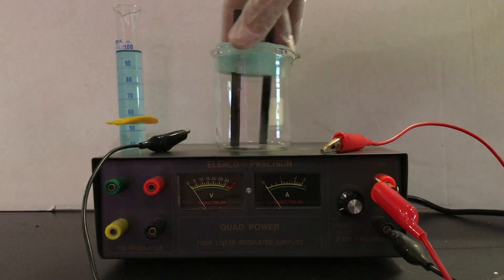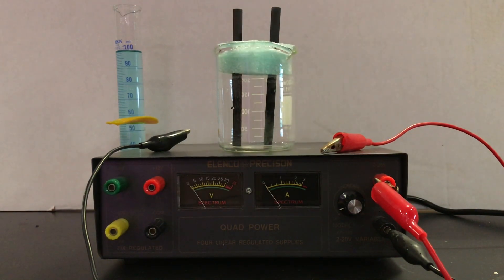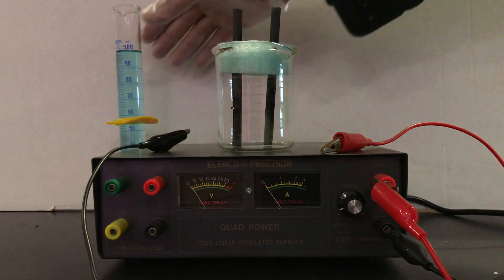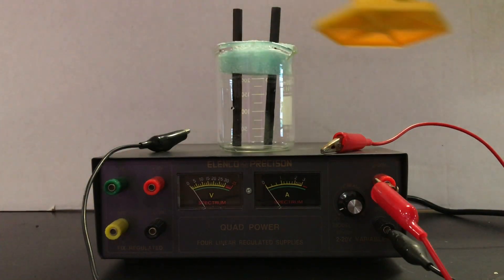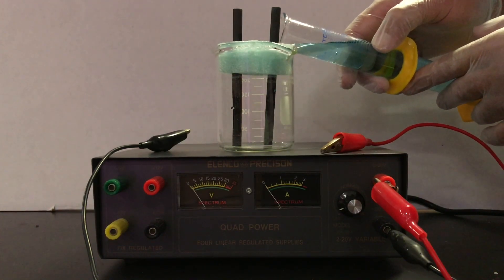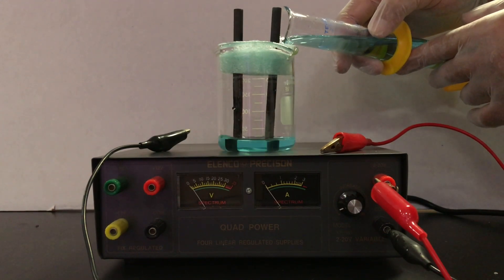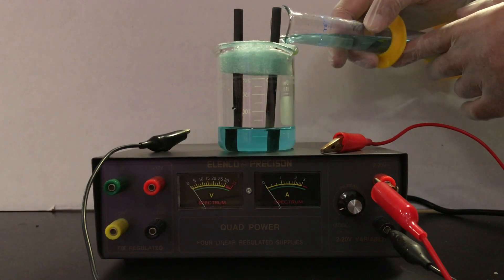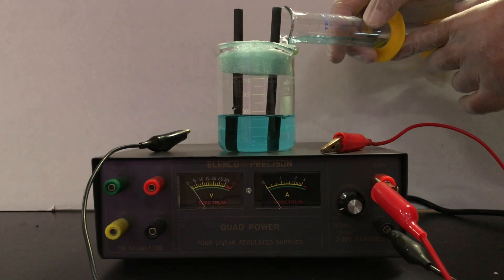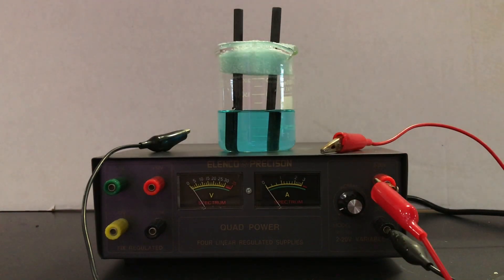We're going to use 100.0 milliliters of copper(II) chloride. I'm going to pour that into the beaker. It has a representative bluish-green color because of the copper(2+) ions forming a complex with the water, and you can see that color against the white background. We are in a fume hood, as one of the products of this electrolysis experiment will be vented out of the room.